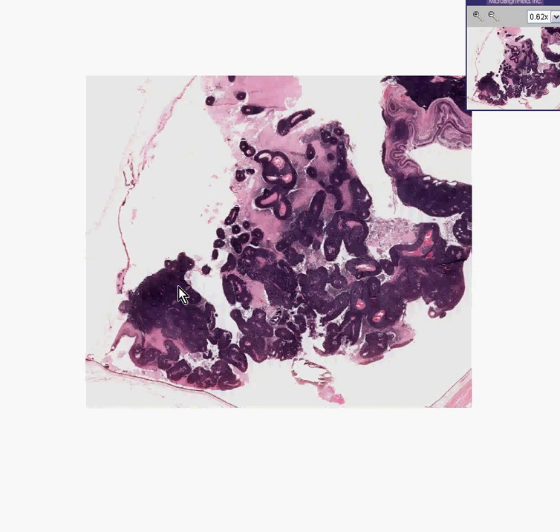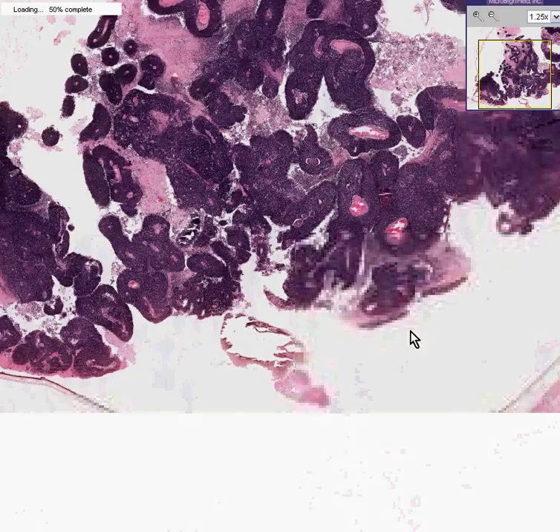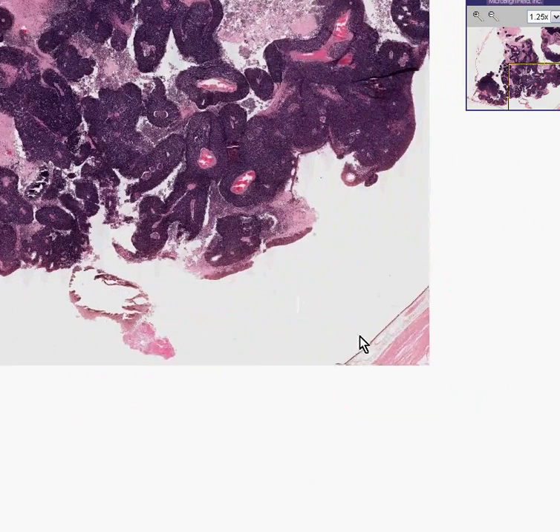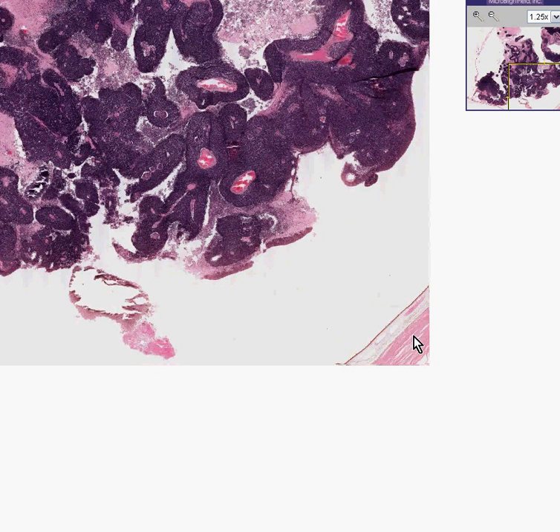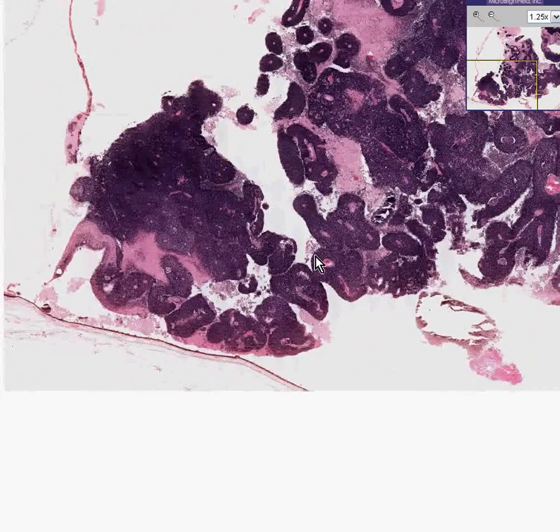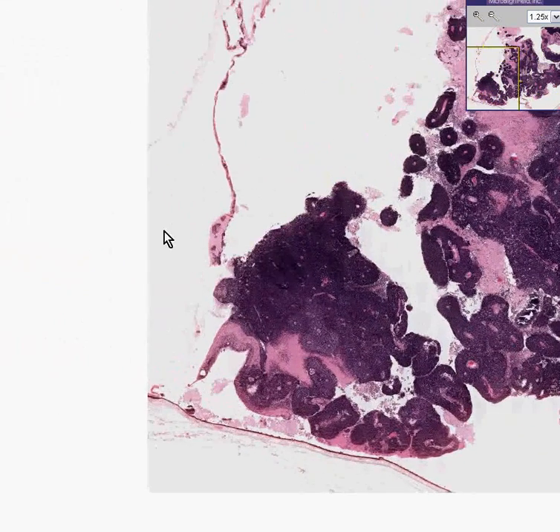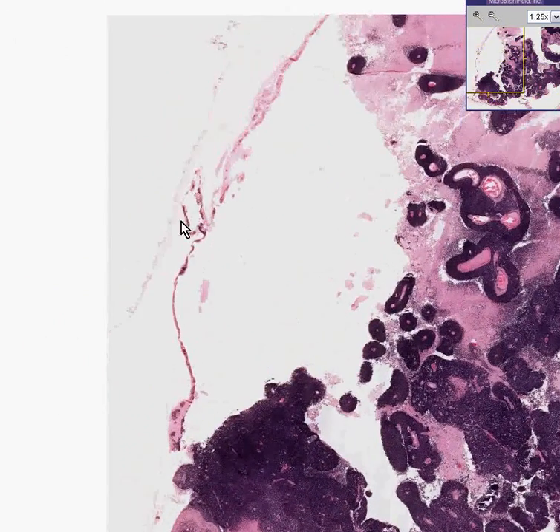This whole specimen here may very well have represented the globe of an eye. The reason I think that is because if you move out towards the edge, it looks as though you're getting some thickened fibrous tissue, or the sclera of the fibrous tunic. You don't really see much of a normal retina on the inside, however. In fact, in this area, you don't even see much of a fibrous tunic anymore.